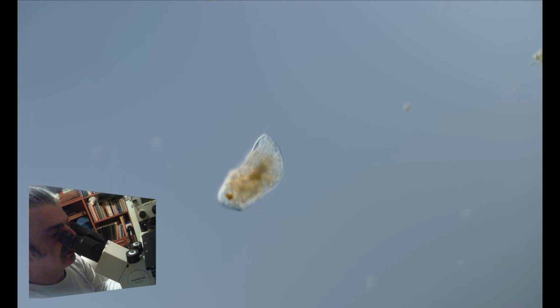Okay, this ciliate, I actually don't know what it is. Could be some type of colpoda maybe, but I'm not sure. I think it's a colpodid. Maybe I'll take it for greater examination later in another microscope.